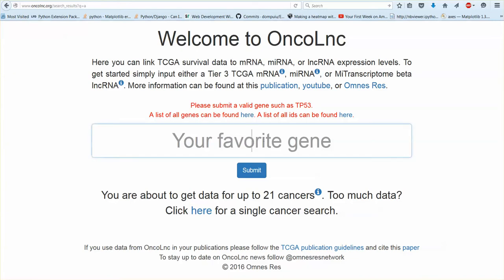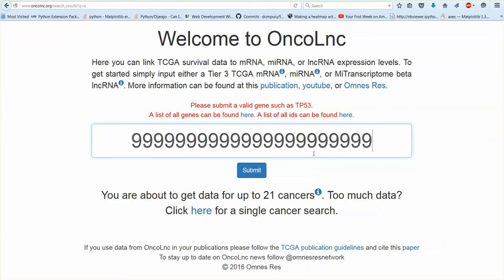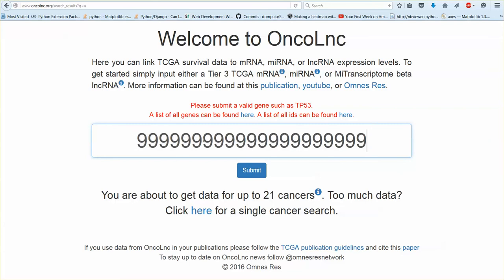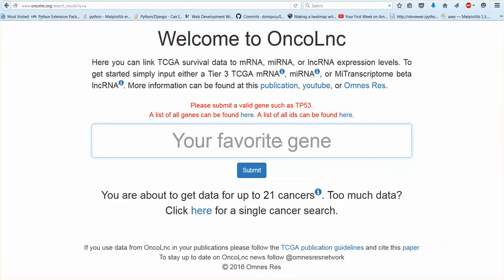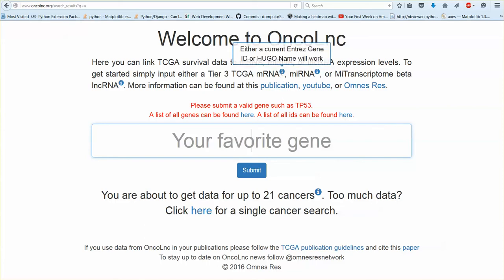And the search box is only 22 characters long because that's the longest possible gene name. So if your gene name is longer than 22 characters you're not using the correct name. So how do you get the correct name for your gene? So Oncolink uses updated ENTREZ gene IDs and HUGO names.